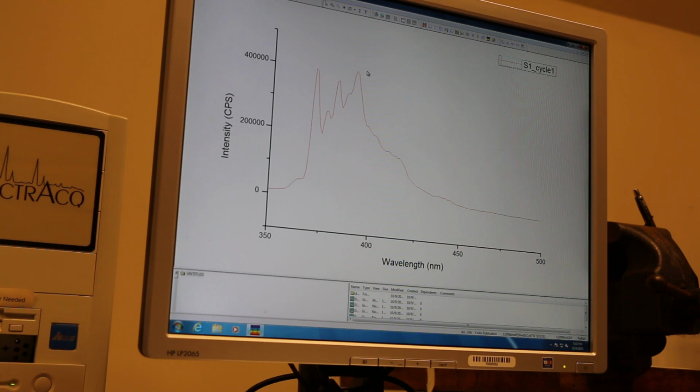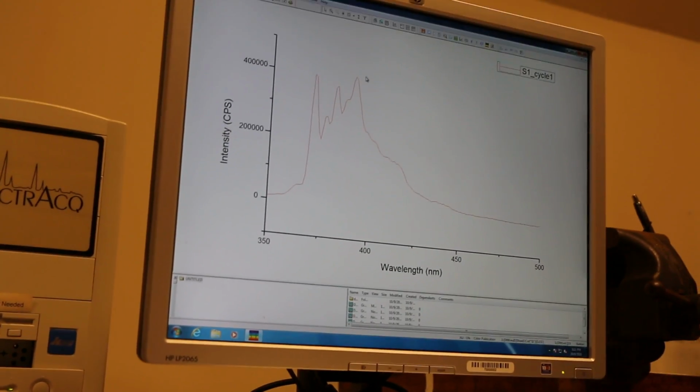And so I use my spectrometer not only in my research, but also in our junior-senior lab course that we affectionately and unofficially called RadLab. So that's a spectrum of pyrene. And now let me show you how the spectrometer itself works.